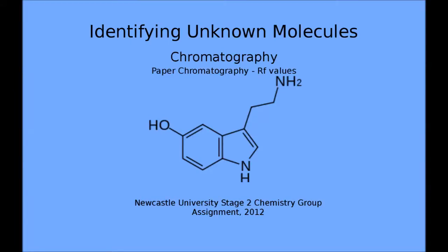You would then put the paper into a beaker containing solvent, and covered, the paper is left in the beaker until the solvent is almost at the top of the paper, at which time it is removed, and the solvent front is marked in pencil. As this example uses coloured components, it should be clear which pen/person is the culprit.